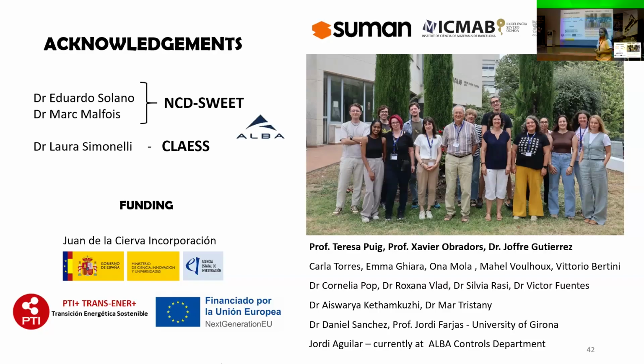The second curiosity, maybe it's a little bit more difficult for you to answer. For the GSAXS, in any small angle in general, it's quite important to know very well which is the noise. It's crucial to take out the noise correctly. So, have you done blank measurements? Yes. We have performed the growth on only STO with no sample, for example.